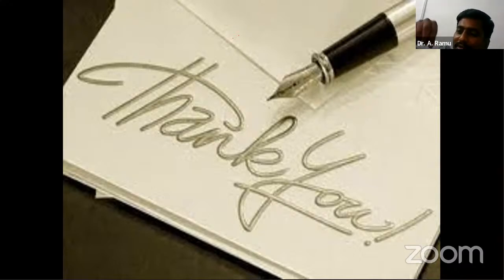So in tea bag fashion, tea bag type lo tie chesi, you can submerge it in the dissolution medium to assess the drug release in the dissolution studies. 5 minutes ki konta sample తీసి you can assess how much amount of the drug is converting into solution form. So like this you have to repeat, you can perform up to half an hour.